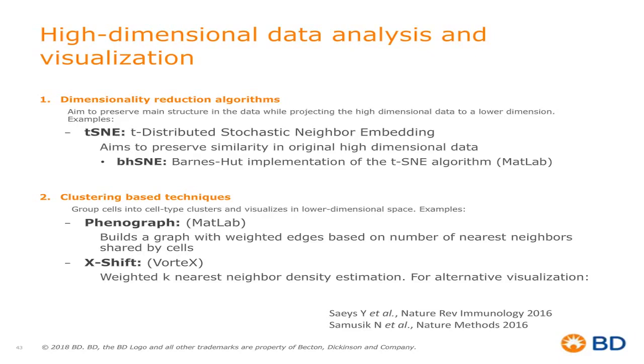We also have some clustering-based techniques that we'll look at. And they group cell types and clusters and visualize in a lower dimensional space how similar the clusters are. And so specifically, we'll be looking at PhenoGraph from MATLAB as well as X-shift.